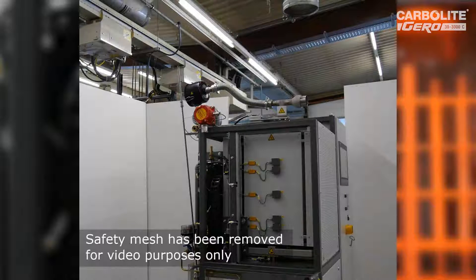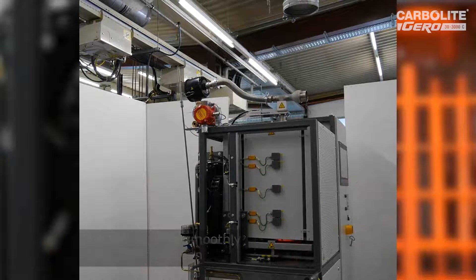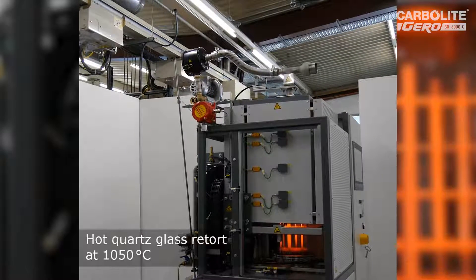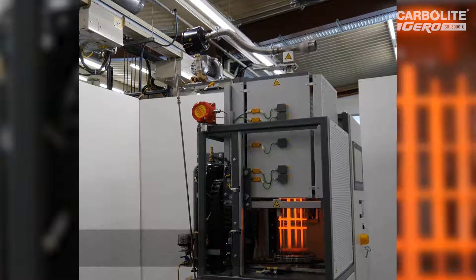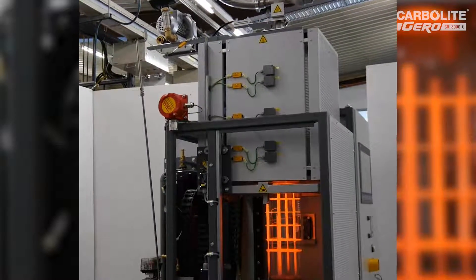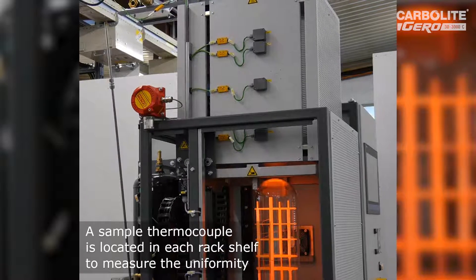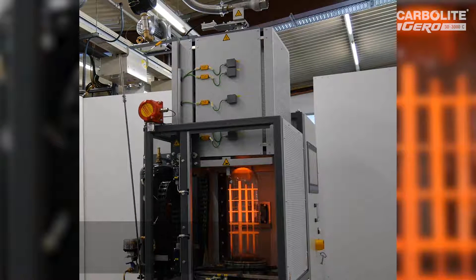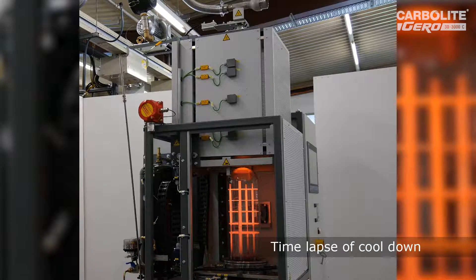We removed the safety mesh here, and what you see now is the automatic movement of the furnace, which is moving away as the sample rack inside and the quartz glass retort is still hot. This can be done even under high vacuum conditions and is a very simple method to help fast cooling. Above the furnace you can see a ventilator based on the so-called Venturi effect, well known in physics. Another fan from outside the retort additionally helps to improve the fast cooling of this furnace.